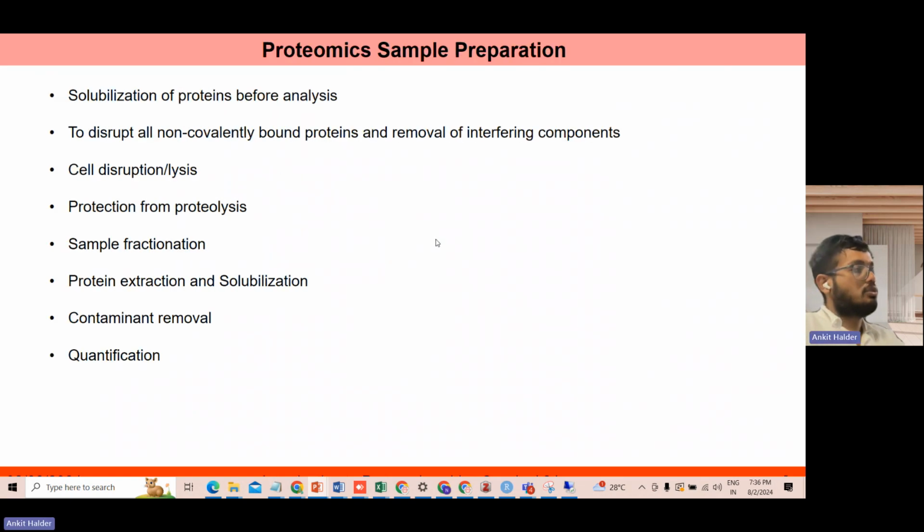So now let us look into one by one content in detail that would help us in coming to a decision, coming to a conclusion for your particular sample. So the research question that you will be addressing, each one of us is quite different, right? Though the downstream process after getting the protein is the same, that you need to make the gel, load it, and perform the electrophoresis and all those things, before getting the protein, the steps and the question for each and every one is different.